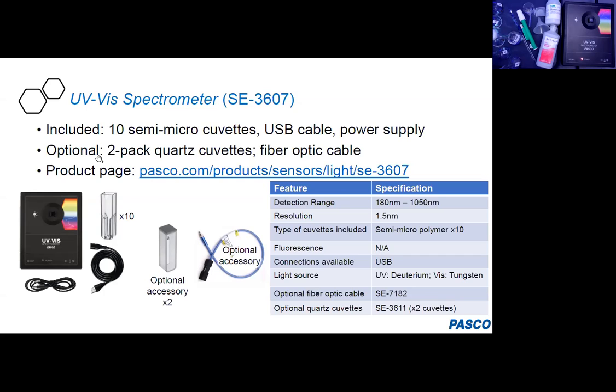optional accessories that you may want, which I'm using in this investigation, sold in packs of 2, the quartz cuvettes. I'm using the quartz cuvettes for this investigation because we're going far down into the UV region. Both of these cuvettes will work for this investigation, but I specifically wrote this around the quartz cuvettes, and they do perform slightly differently. So keep in mind I'm using quartz today.